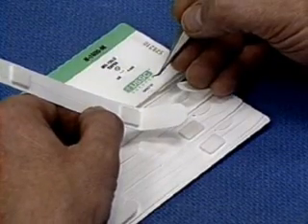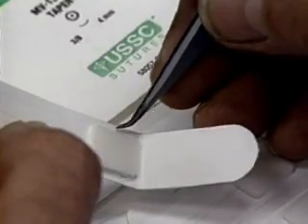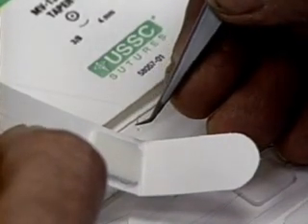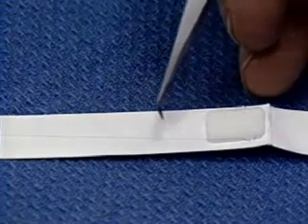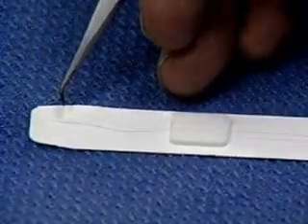We use a clinical grade suture material that's packaged for laboratory use. It's 10-0 nylon on a sturdy 140 micron needle. 12 centimeters of thread is all you need. If there's more, cut it off.